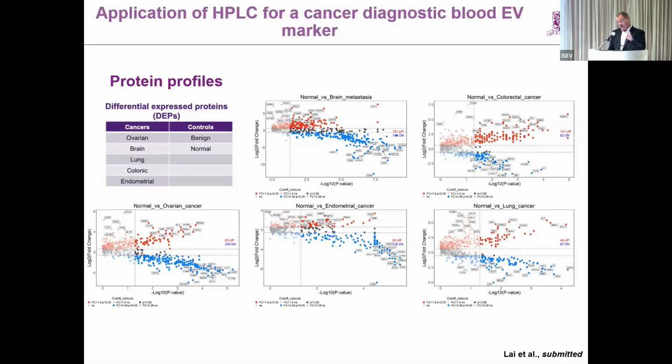And this was done really as a proof of principle. For example, for the lung cancer, we had our biomarkers. Ovarian cancer, Carlos had biomarkers, and a few other collaborators had their biomarkers for their cancer type. So we actually did the isolation and then confirmed, for example, our 4 biomarkers I showed you before are in the lung cancer proteomic profile and actually quite nice standouts.